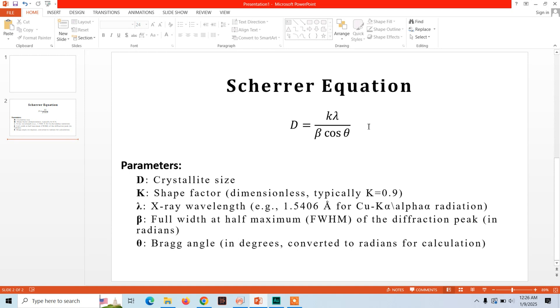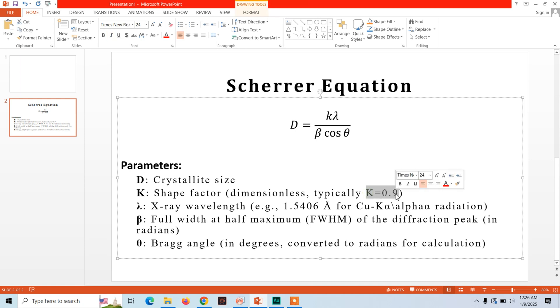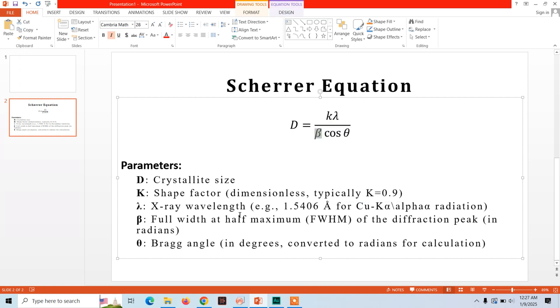Before jumping into the calculation, let me show you the Scherrer equation. The Scherrer equation is D equals K lambda divided by beta cos theta, where D is the crystallite size which we will calculate. K represents the shape factor, it is dimensionless and its value depends on the shape of the crystallite, but if you don't know its value you can use 0.9 as a good approximate value. Lambda is the X-ray wavelength, and for X-rays its value is 1.5406 Angstrom. Beta represents the full width at half maximum of the diffraction peak, and theta is the Bragg's angle.